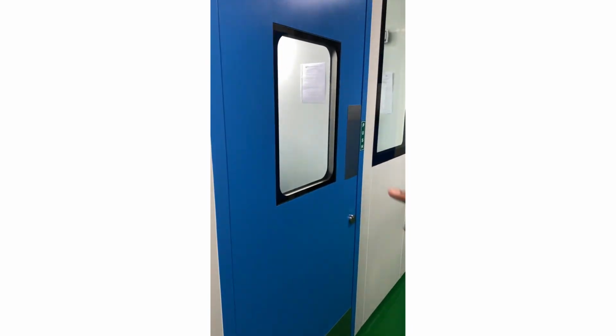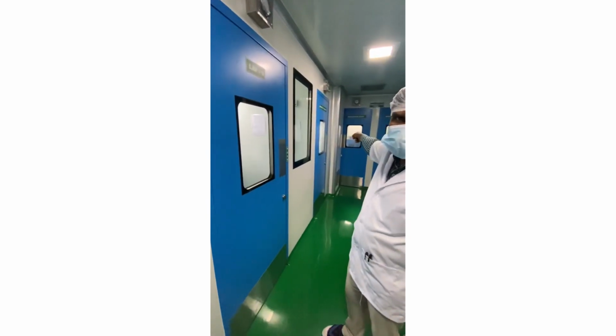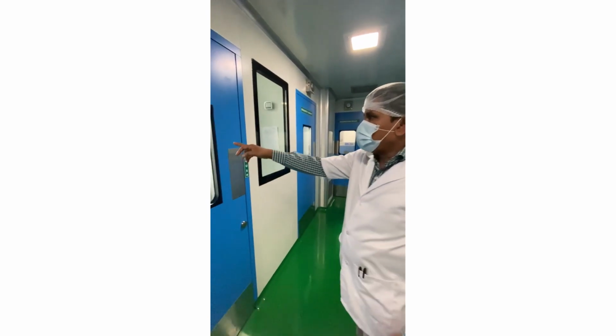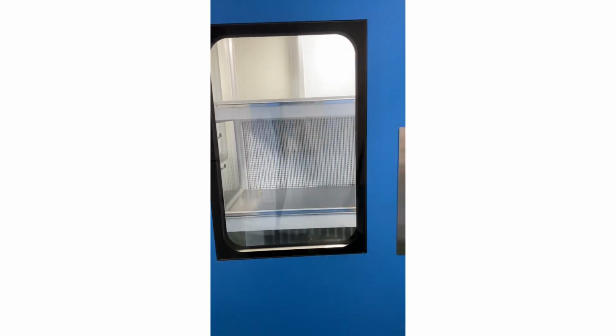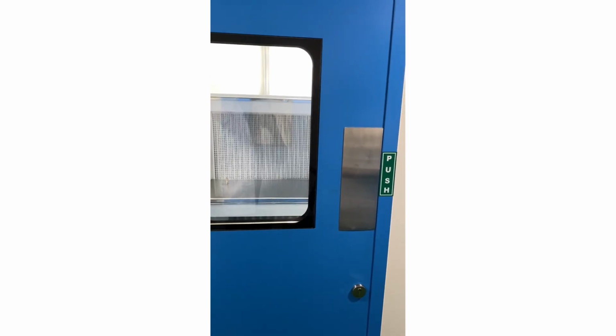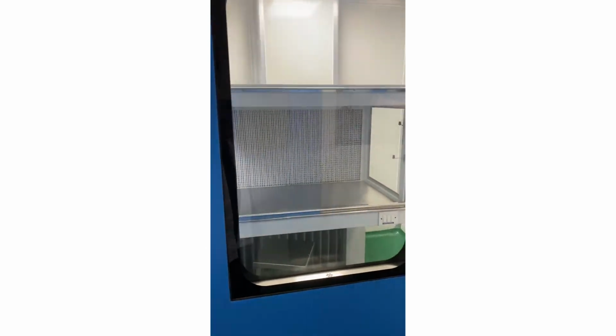After completing the analysis, we keep the plates for incubation in that room. Because we have one more laminar airflow chamber like that, and because we have a lot of samples for analysis, raw materials, finished products, and R&D samples. This is laminar airflow chamber 2, and here also we can perform it.